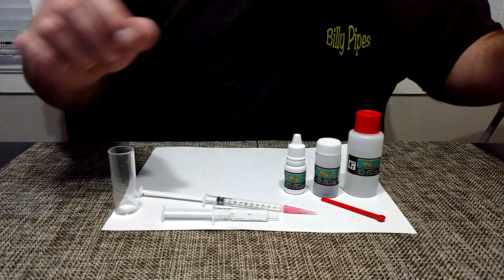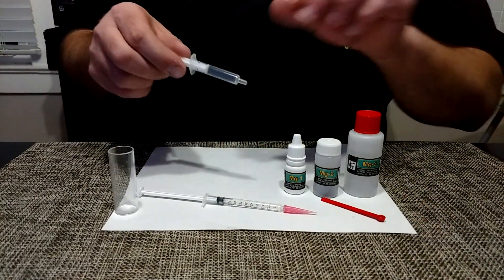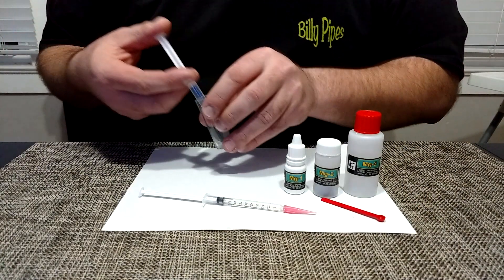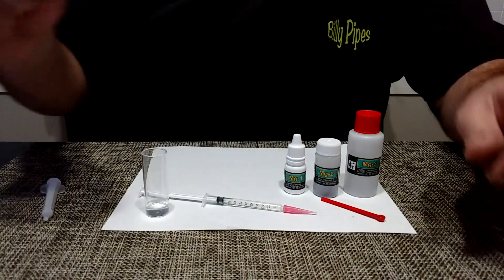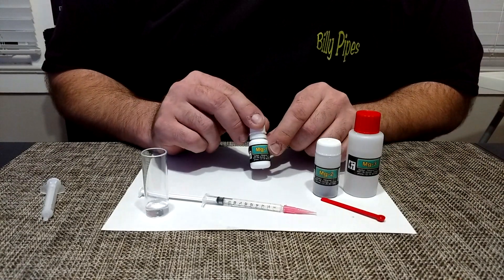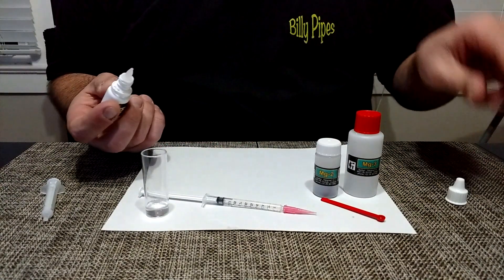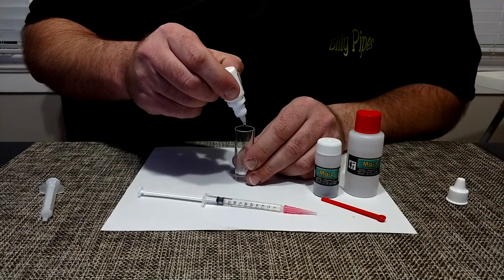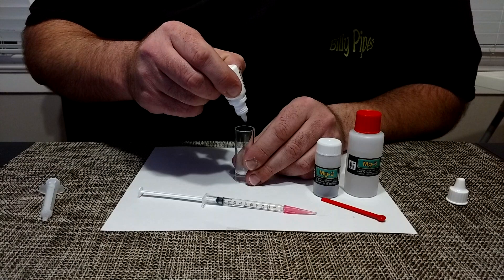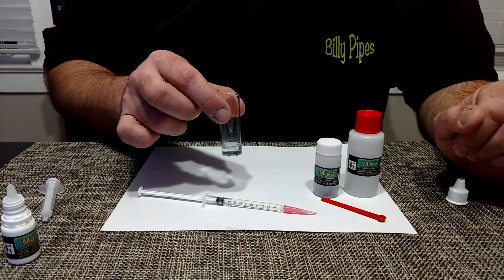Step one, you need two milliliters of your tank water. Step two, you want to add five drops of the MG1. You want to gently swirl this for 30 seconds.